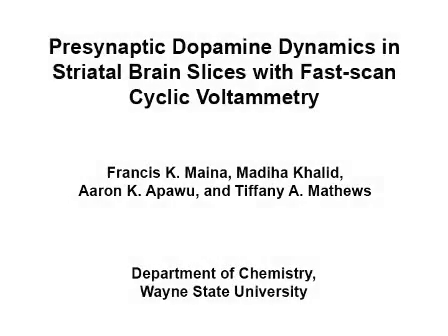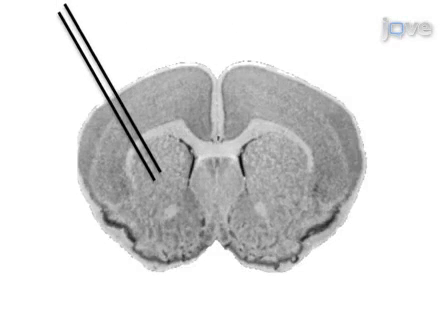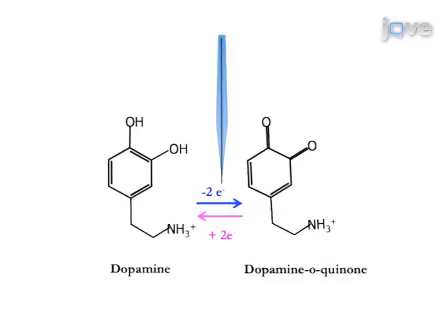The overall goal of this procedure is to illustrate a general protocol for slice fast-scan cyclic voltammetry. This is accomplished by first preparing the brain tissue for coronal slicing. Then, electrodes are placed onto the discrete brain region of interest. The next step is to deliver voltage as a triangular waveform through the electrode to detect dopamine.